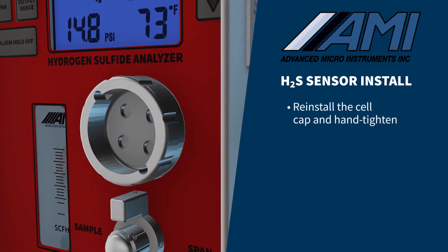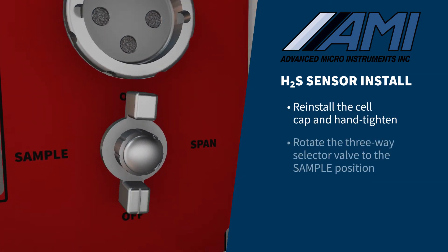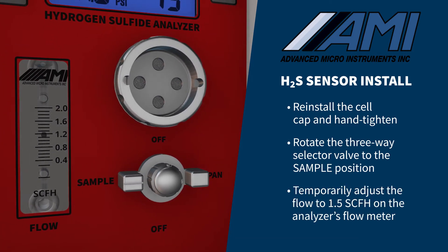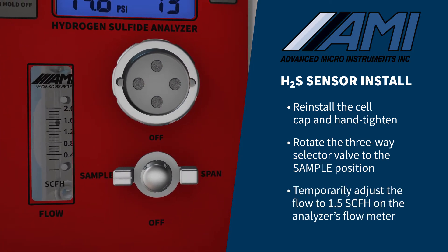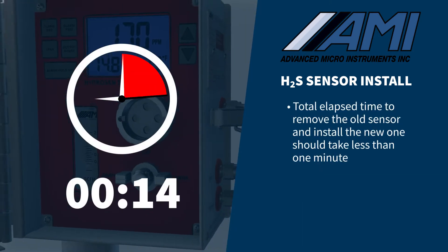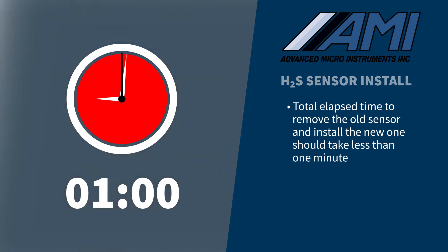Reinstall the cell cap and hand tighten. Rotate the three-way selector valve to the sample position and adjust the flow to approximately 1.5 SCFH on the analyzer's flow meter. The total elapsed time to remove the old sensor and install the new one should take less than one minute.